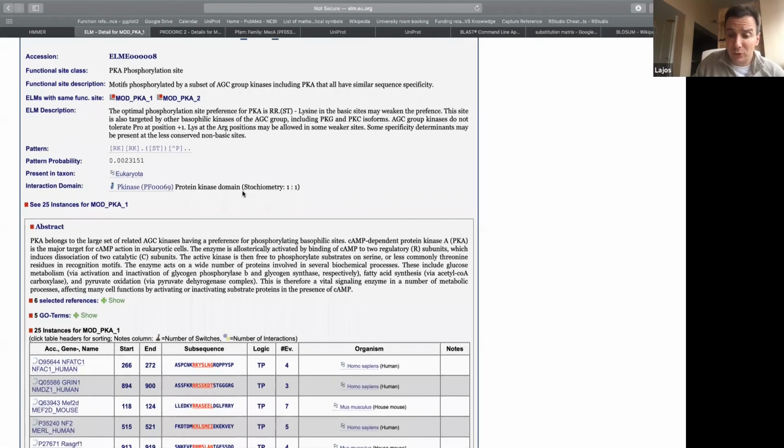And it's also true for nucleotides. There are many times when you are just looking for a small promoter sequence, and you can find the same sequence within the gene as well, because it's just too small. So in a coding sequence part, which is not a real promoter sequence motif. But if you go up and define more nucleotides, for example, in the case of nucleotide search, then you have a chance that you will miss it because there is a SNP there.